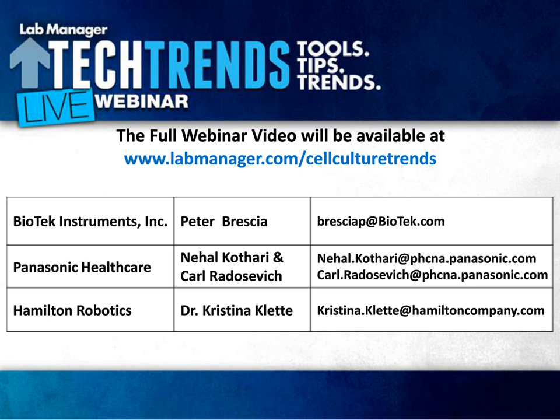Great, thank you. Kristina, this question is directed at you. What's the best method to keep cells from settling, and what's the minimum amount of cell suspension to have in the reservoir when plating in a 96 or 384 well plate?